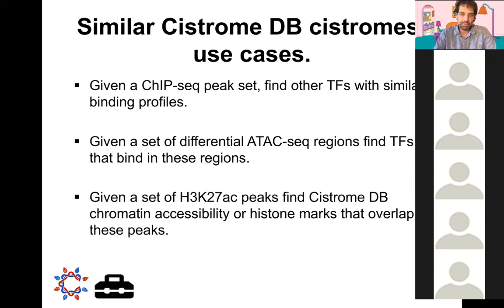And then, for example, you could also have a set of K27 acetylation peaks. Cliff? Hello, yeah. Just a quick comment to make that I completely agree with you that examining differential peaks with this approach is very useful, and we've built that into a recent pipeline we put together to analyze differential peaks. So yeah, that's great, and also single cell, similar kind of thing. It's a very helpful thing.